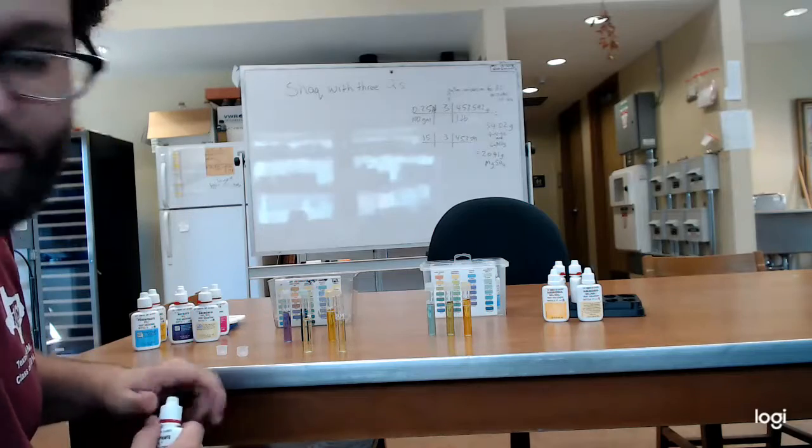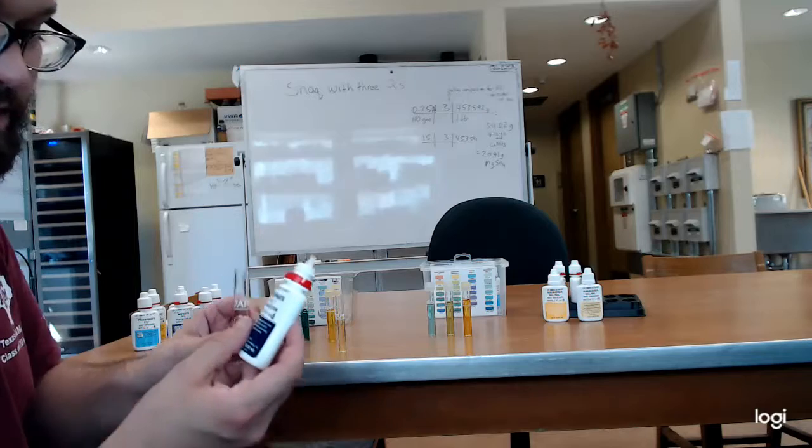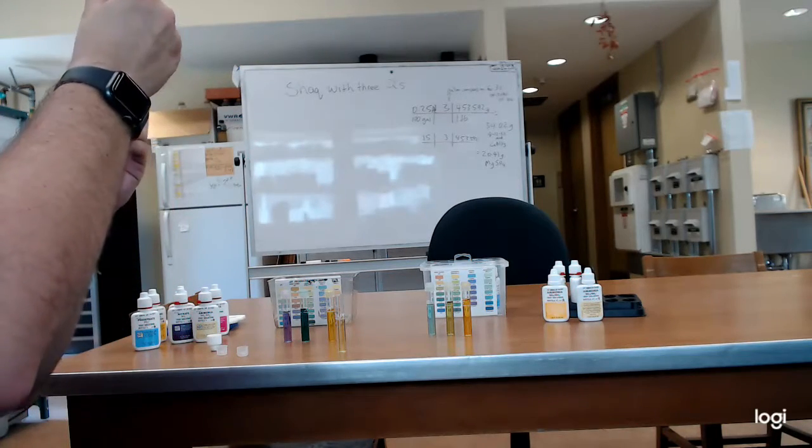And like I was saying, titrations, both of these kits costed about 30 bucks. Not too much. And if something happens to them, then you're only out about 30 bucks and you're not out a $1,000 probe.